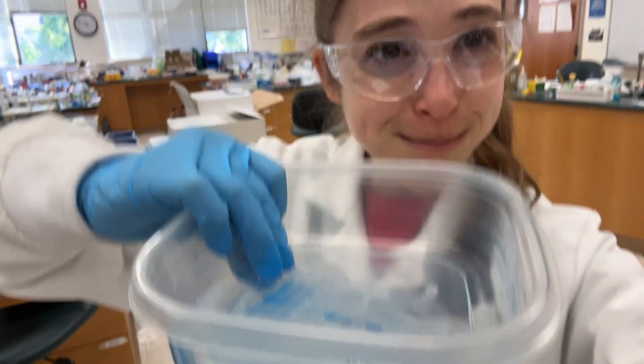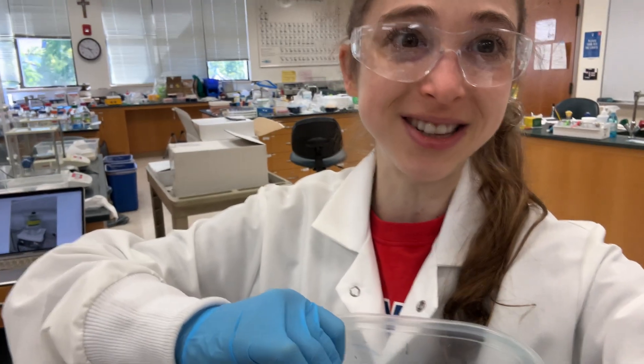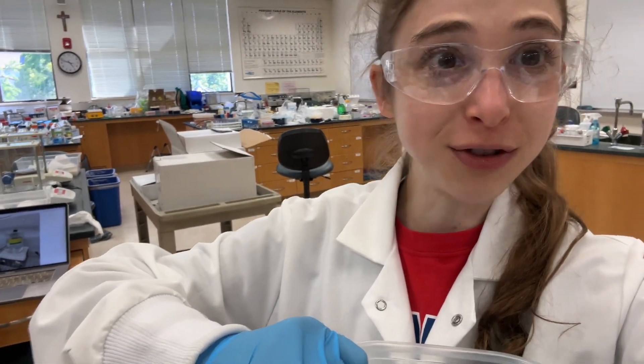Just kidding — look at that fat band! That is our protein. So yesterday when I left you, we were in the middle of a protein purification and we were exhausted. It had been a long day, and our protein was doing dialysis. Basically, dialysis is where you remove extra salts and stuff.